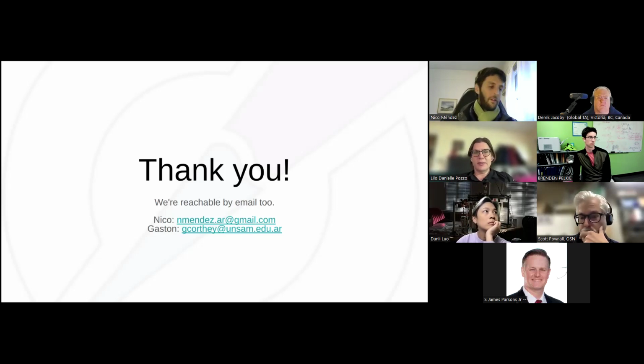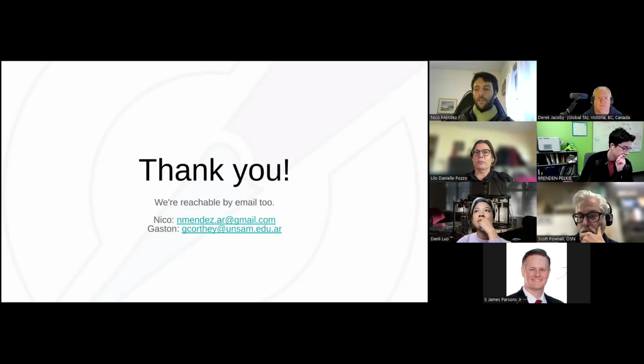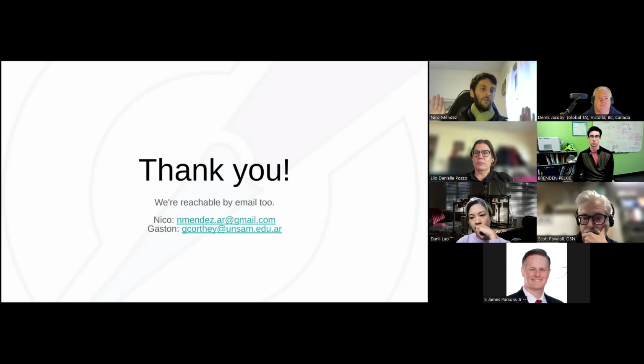Well, I think there is an intermediate. We will try to get as close as we can to commercializing it, just to serve the needs of everyone. That might be different, right? So we have the UI and we have the Python thing, and we would like to be able to send you a full robot and also just give you the parts list and the kit as well.